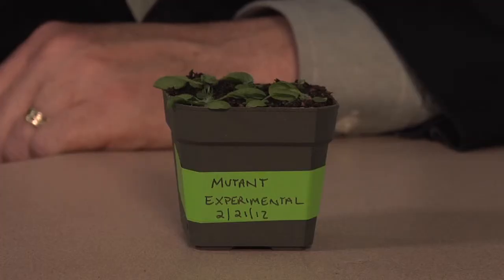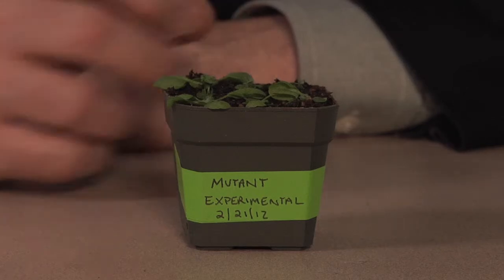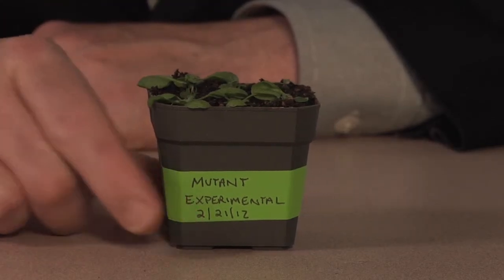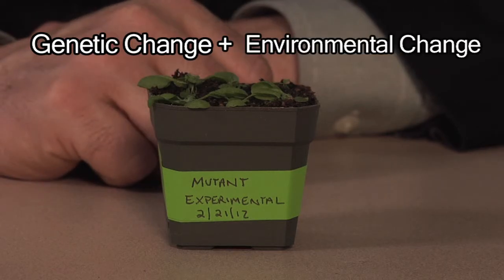Finally, I want to examine the effects of the 2 independent variables together. This mutant experimental pot has experienced both the genetic change and the environmental change. To examine the effect of the combined variables, I put the pots back into the 2x2 arrangement that I started with. Here are the wild-type and mutant plants that I've grown under control conditions.